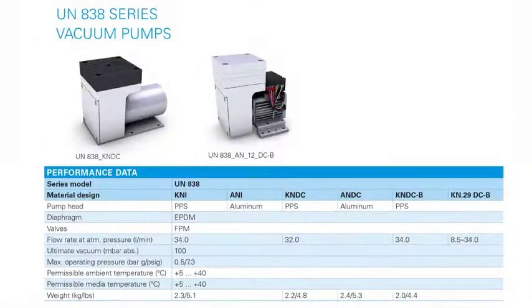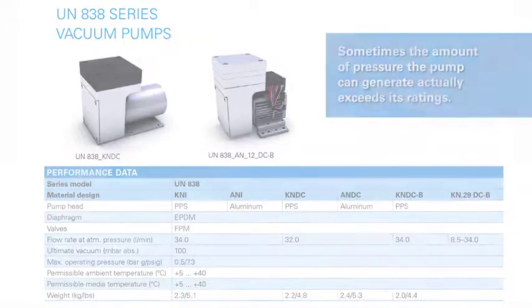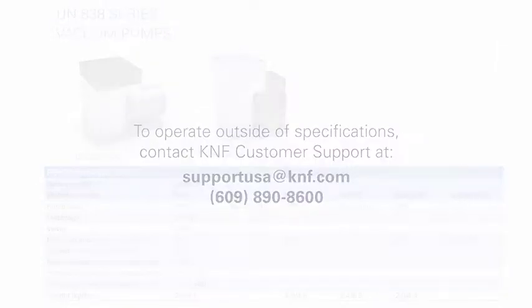It is important to note that pumps will often generate more pressure than the rated pressure capability on the datasheet. Running the pumps above the rated pressure may have an impact on service life and could cause premature wear or failure. Please consult KNF before running a pump outside of the rated performance specifications.